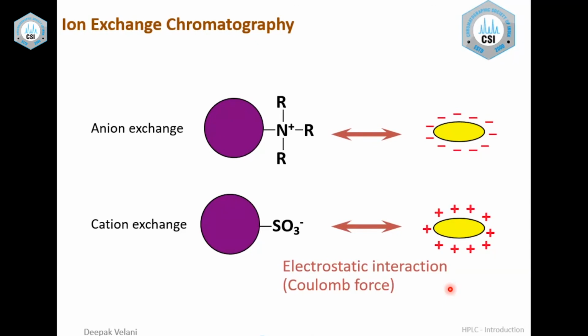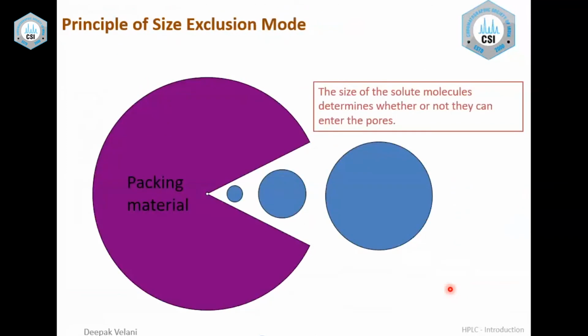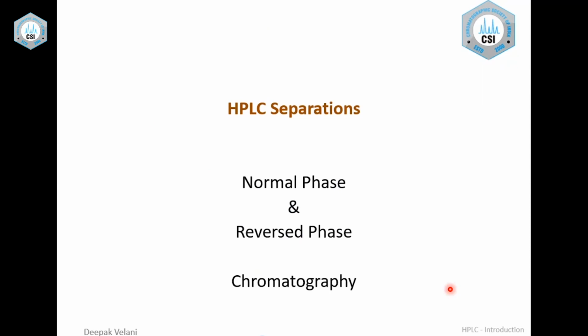Now, instead of going much into the mechanism of ion exchange and those things, I'll prefer to go directly onto normal phase and reverse phase, if allowed. Hope that should be okay.